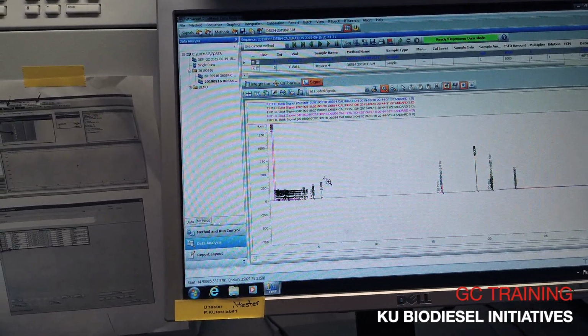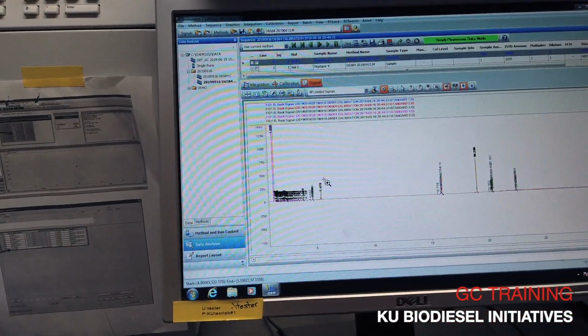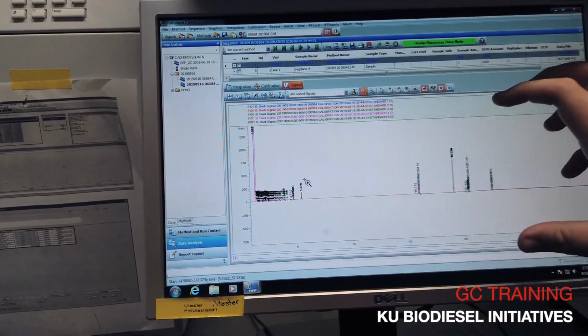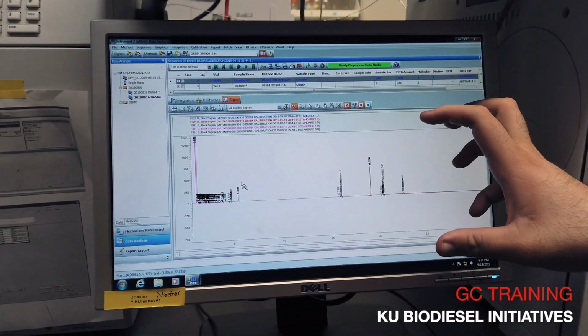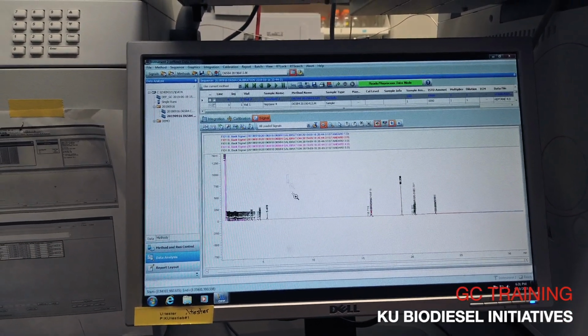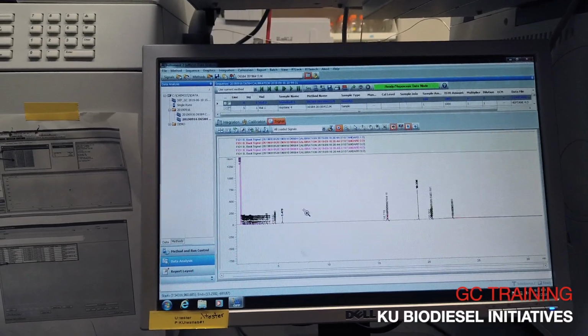So when you do this, you want to do small but wide if you want to get into a deep zoom, because if you just try to do this, then it won't really give you that much detail.